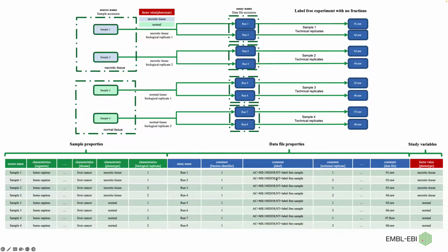You have the concept of replicates, but in proteomics, we also have the concept of fraction. And this is really common. When you do a TMT, you multiplex multiple samples in the same channel. And when you do fractionation, you split multiple samples into different rows. Then at the very end of the table, you have a raw file, and at the very beginning, a sample. And these three columns define how this will be combined, or how they would be related.